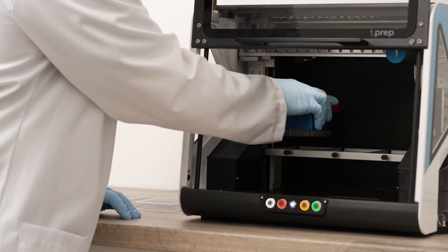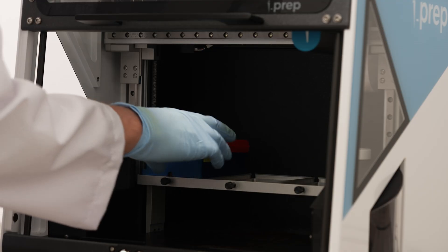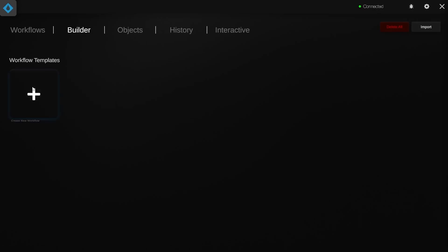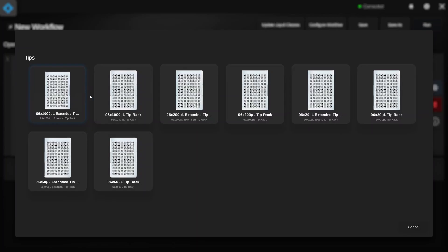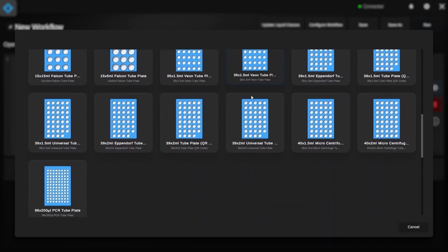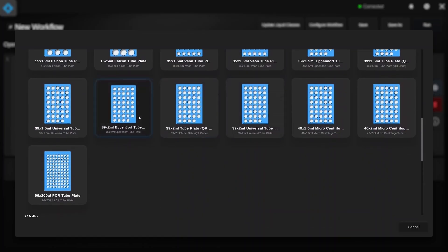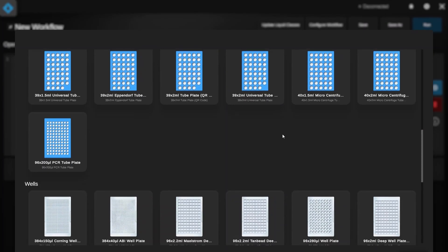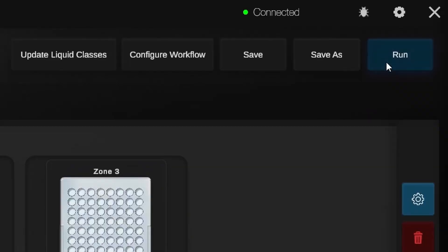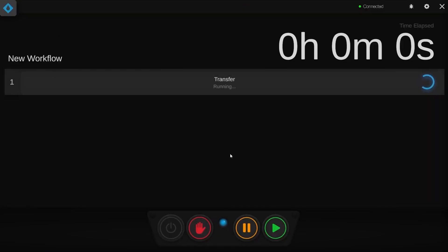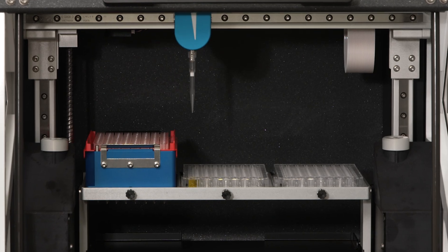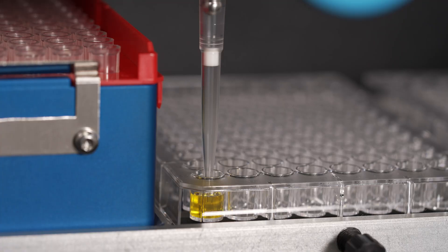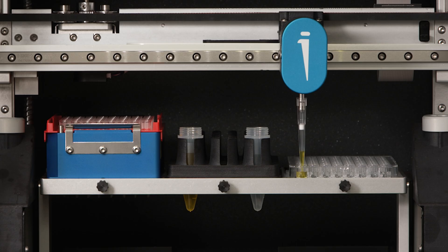Building pipetting workflows with iPrep is simple. Set up your new workflow or open an existing workflow in the Flow software application. Once your workflow is ready to go, press run and follow the on-screen prompts to insert the correct objects. Flow allows you to easily build complex pipetting workflows and quick simple transfers.